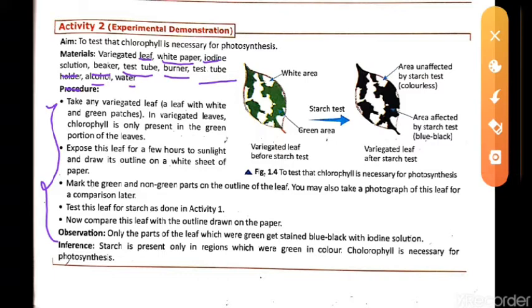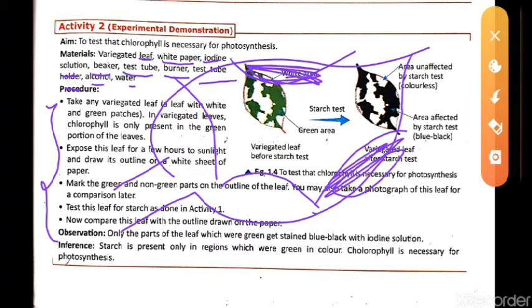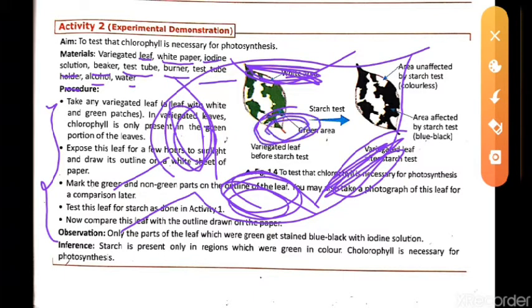I don't think that you need all these things. You just need some of them. Whatever we did in the previous activity, that leaf, when we dropped the iodine solution at the end, some patches appeared, and this portion became bluish in color. So that black bluish color is the indication that starch was present.